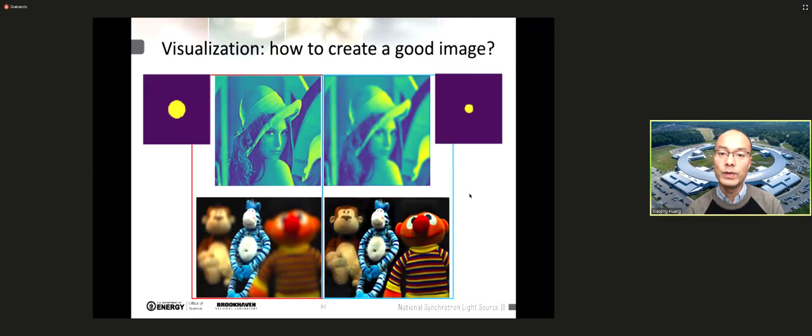And of course, in some cases, you don't want to make such a compromise. You want to achieve high resolution and have extended depth of field simultaneously. Then we present two methods to do that, either multi-slice ptychography or the focal stacking method. Using either technique, you can have both benefits simultaneously.